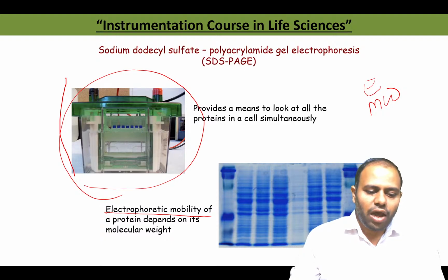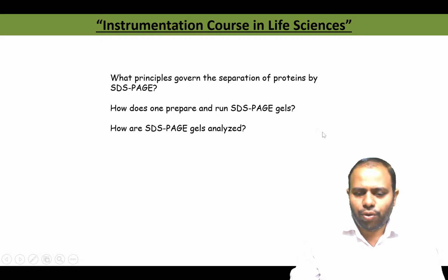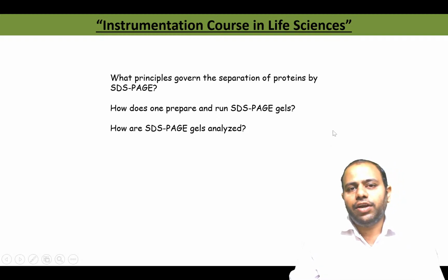Now let us see the principle that governs SDS PAGE: how to prepare an SDS gel, how to analyze the gel, or how to stain the gel. The protein bands are not visible by default. Clear? They have to be stained using different stains.